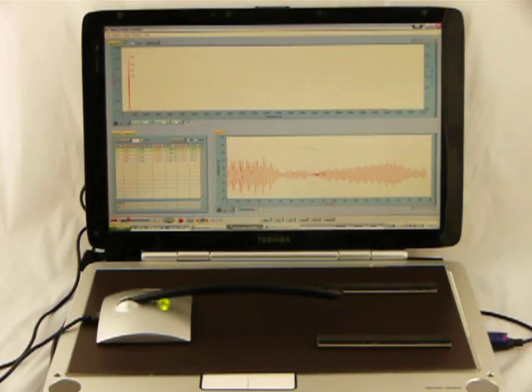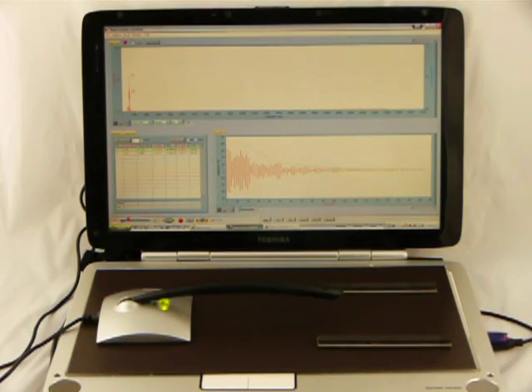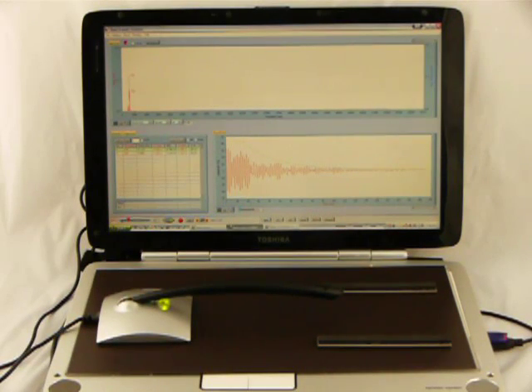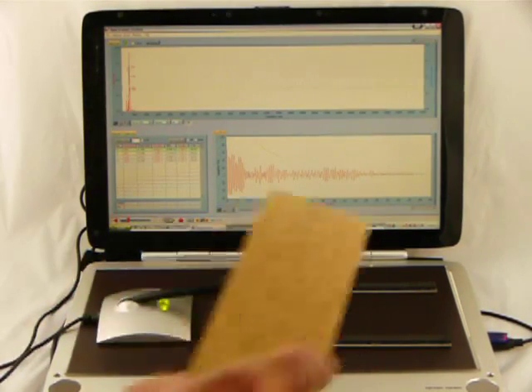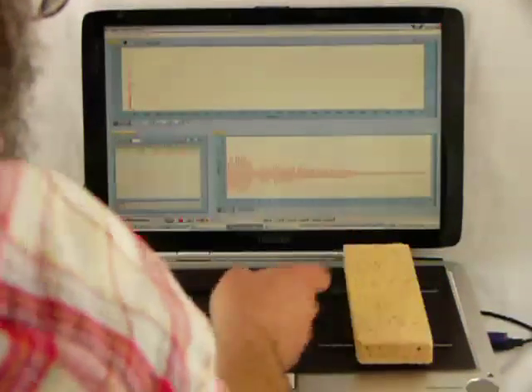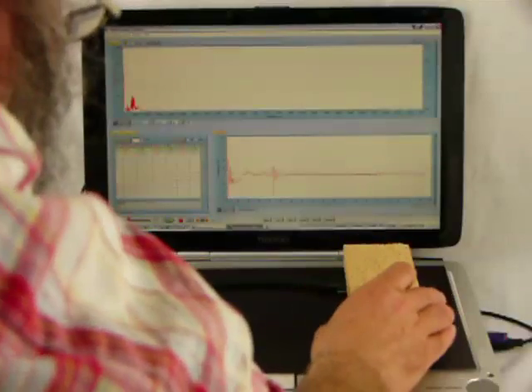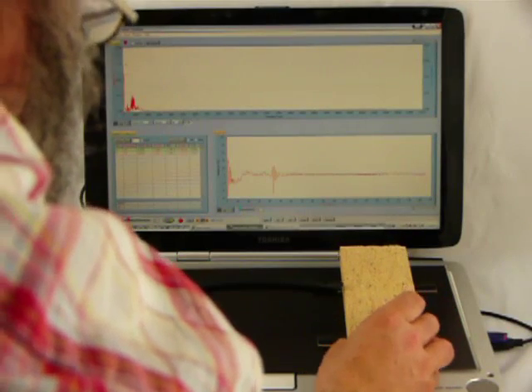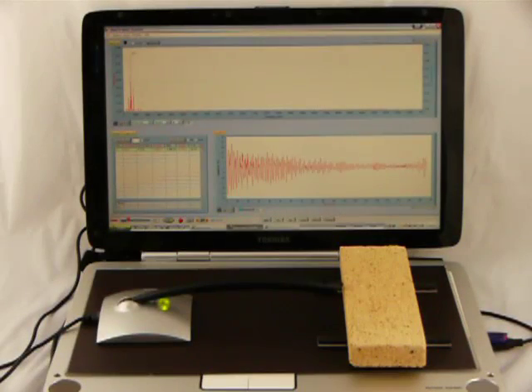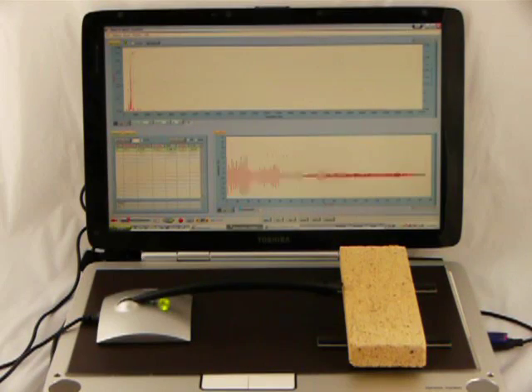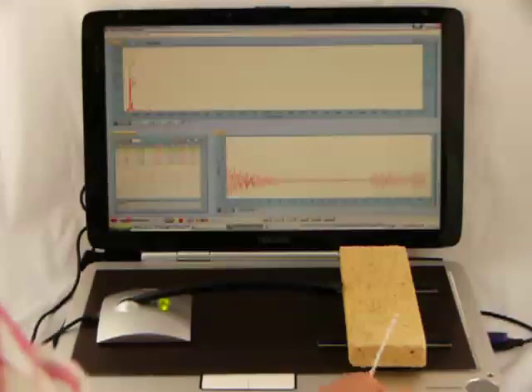That should be turned on. So as you can see when I'm talking now, it's actually doing some analyses in the background. Now we'll put the sample on the knife edges as before. Okay, the sample's ready.